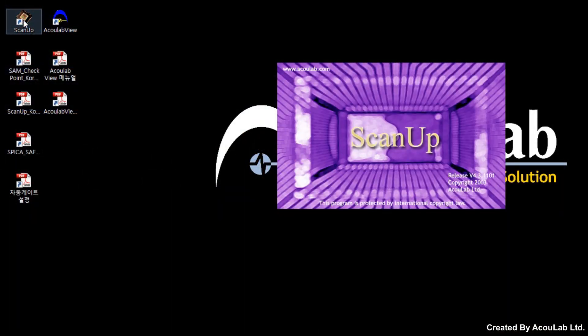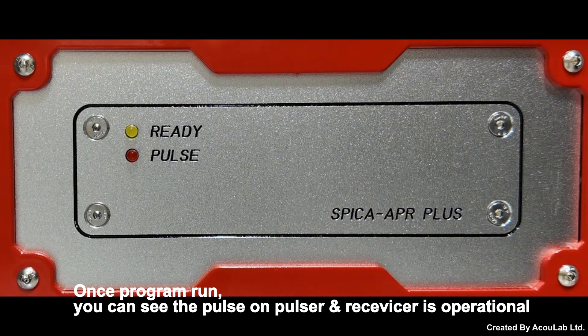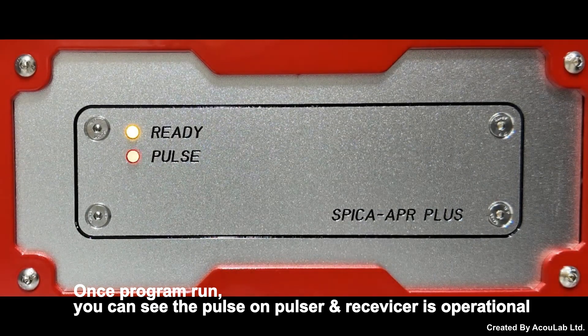Run the scan up program. Once the program runs, you can see that the pulse on the pulser receiver is operational.